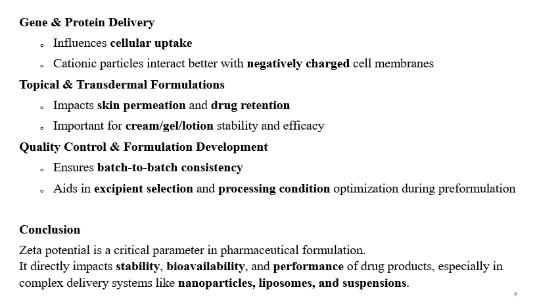Quality control and formulation development: zeta potential measurement ensures batch to batch consistency. It helps in excipient selection and processing conditions for optimization of the formulation. It is also helpful for the composition finalization during pre-formulation studies.